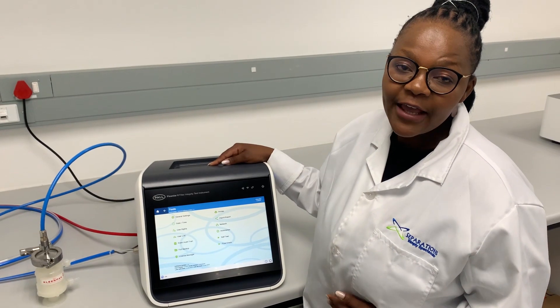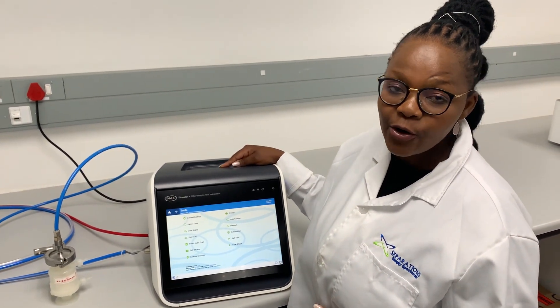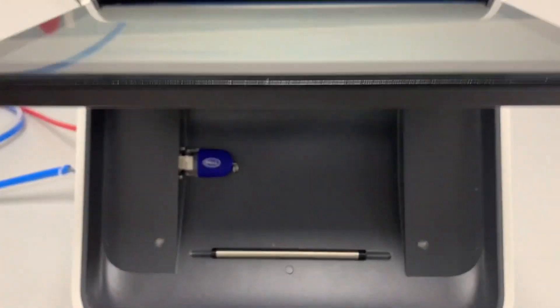The Flowstar 5 can store up to 10,000 test results and allows for 500 programs to be stored and 250 users.